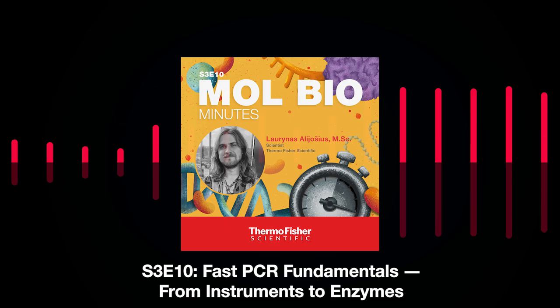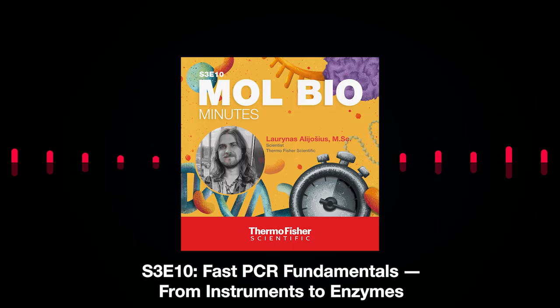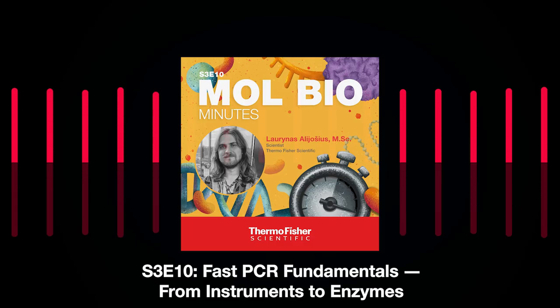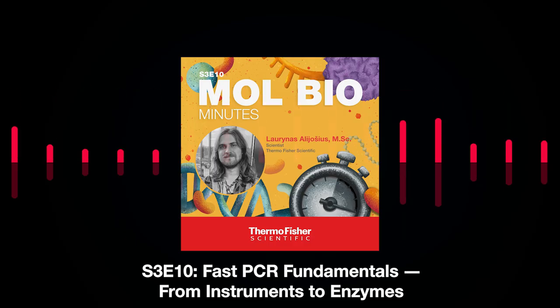You guessed it. In our lab, we love to use the engineered polymerases for a fast PCR because they are just many, many times quicker. When we talk about the engineered DNA polymerases, another nice feature is a hot start option to have available with the DNA polymerase, which is nowadays almost like a standard for the DNA polymerase to have.